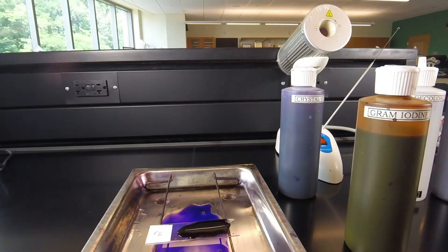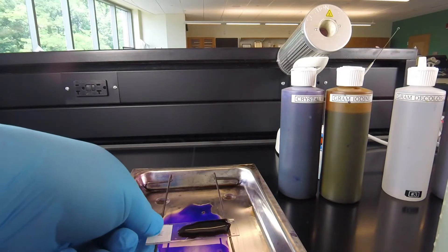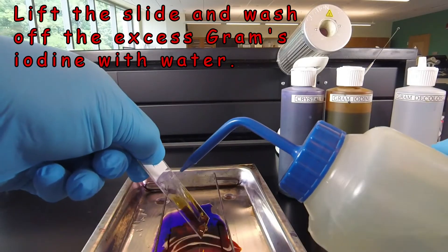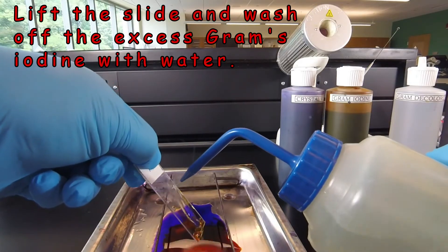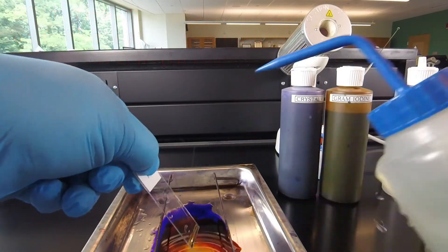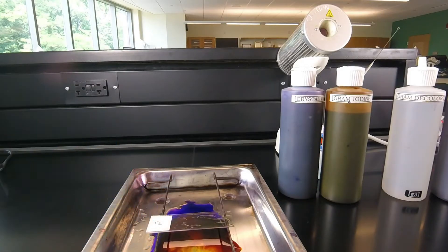One minute has gone by. We're ready to wash off the excess iodine using our deionized water. Again, we direct the water above the smear, let it run down over the smear watching the bottom of the slide. When the excess iodine has come off, we shake off the excess water, and we're ready to move on to the next step: the decolorization.